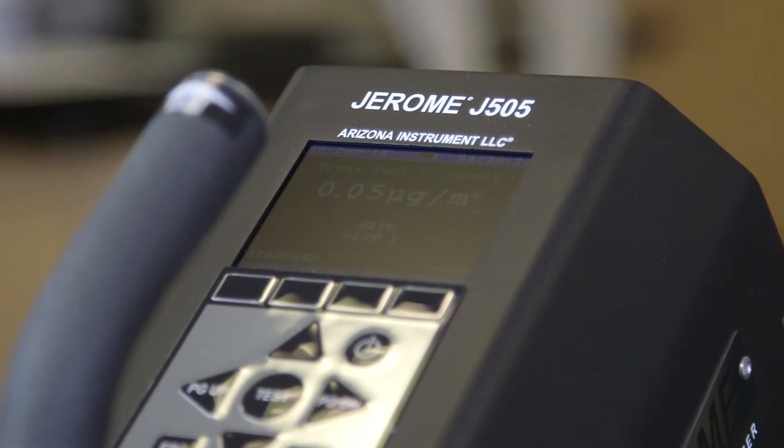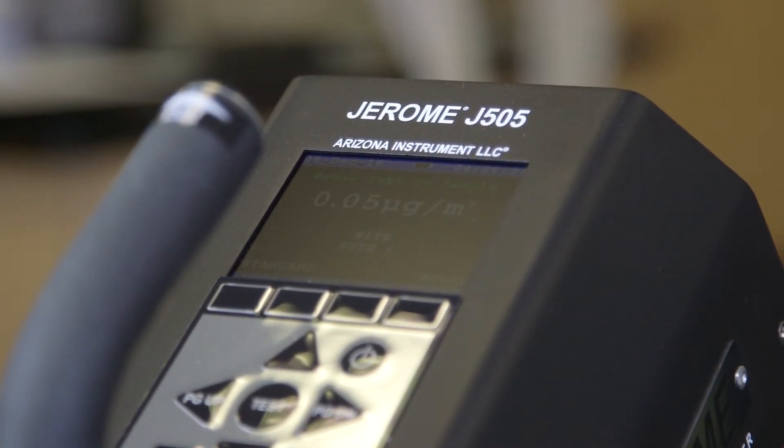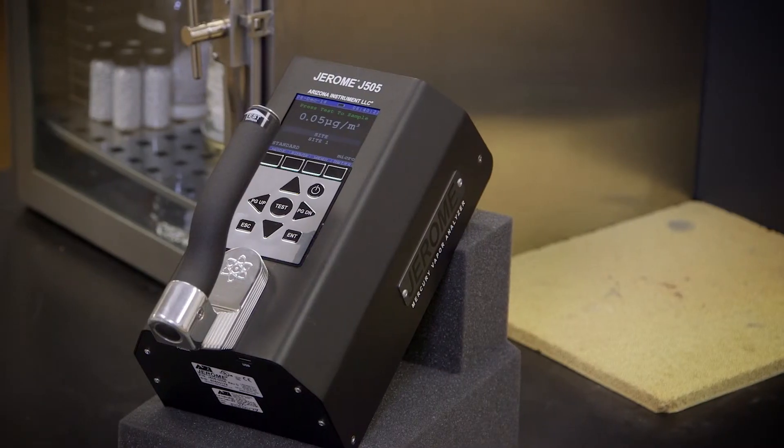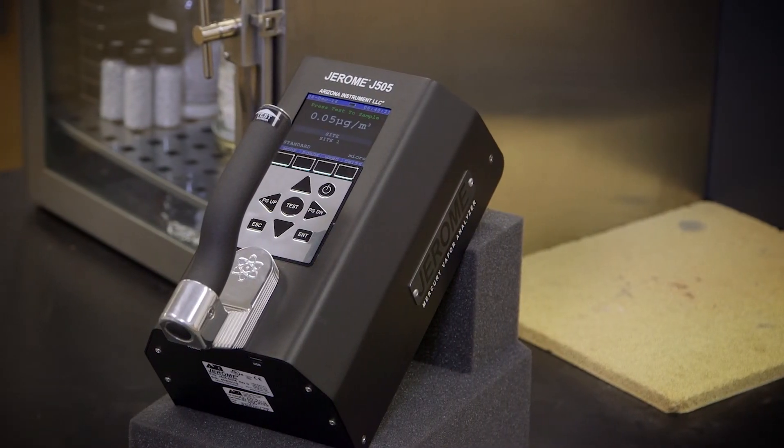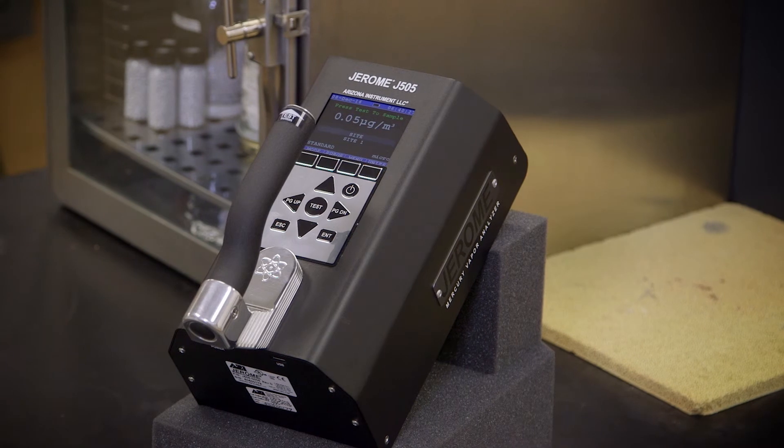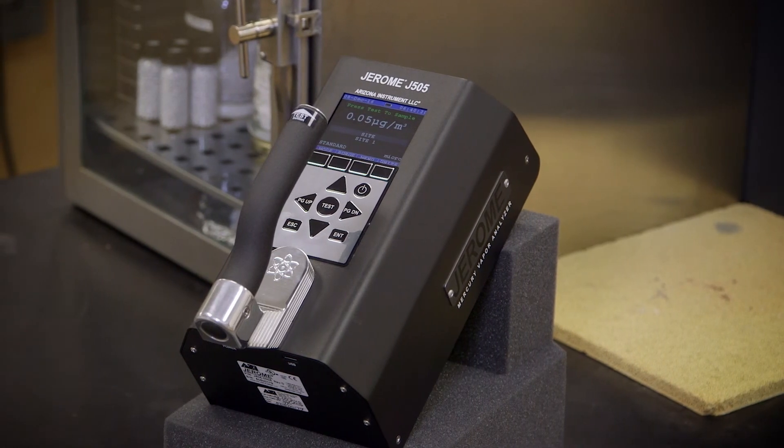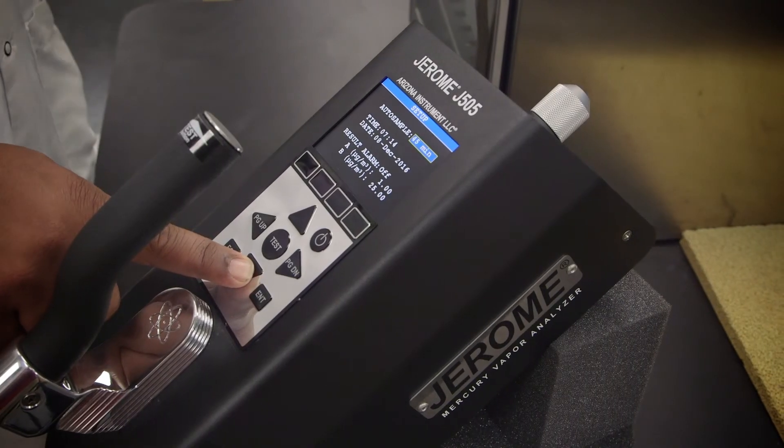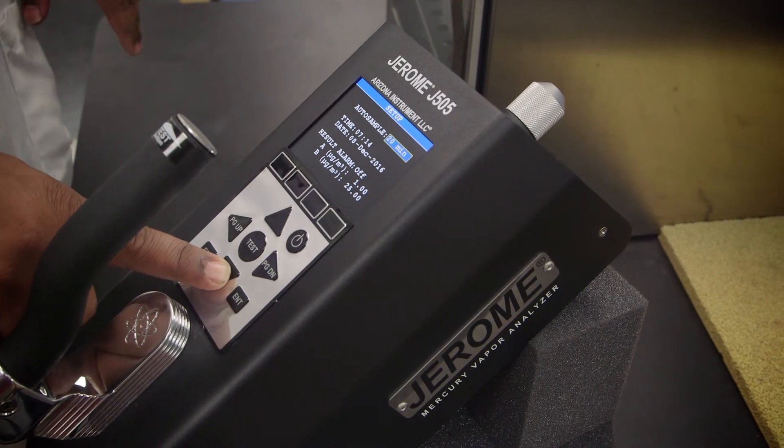The J505 meets and exceeds EPA standards for industrial and residential remediation actions and is in active use by the EPA, Los Angeles County, the City of New York, and many others.